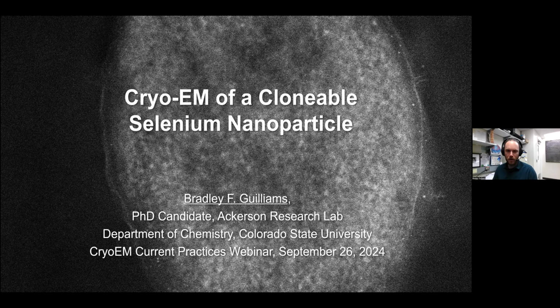I'll show you the result of a lot of work that's happened in the lab leading up to this, where we're developing a clonable contrast tool for use in electron microscopy imaging, as well as some fluorescence imaging. And then after that, I'll transition into the single particle cryo-EM project I've been working on that is still actively happening. So let's get started.